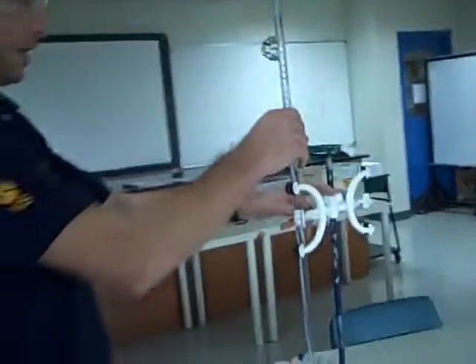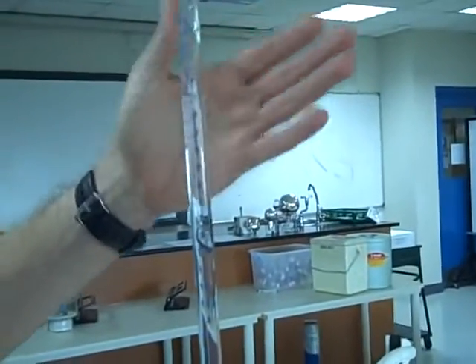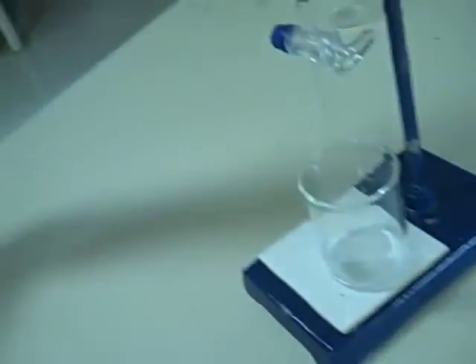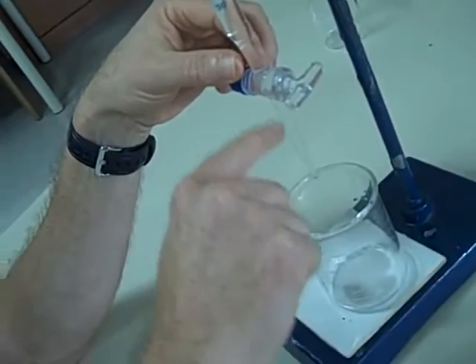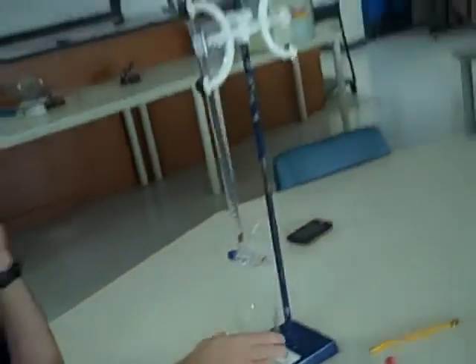You're then going to take a note of this reading — it's 0.60 cc's. Note that down in your results table as your initial burette reading. You need to make sure your burette tip is filled. I made sure mine was filled because I let some acid out, but if no liquid has come through, you need to empty it until you get rid of any air bubbles from the tip. You might then need to refill your burette or just start with it close to the zero point.